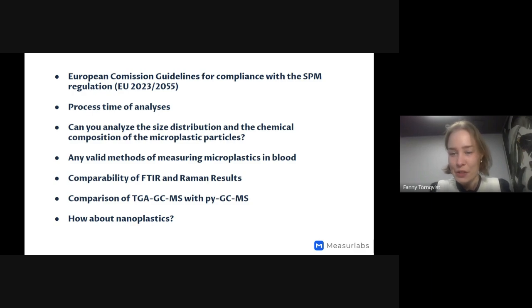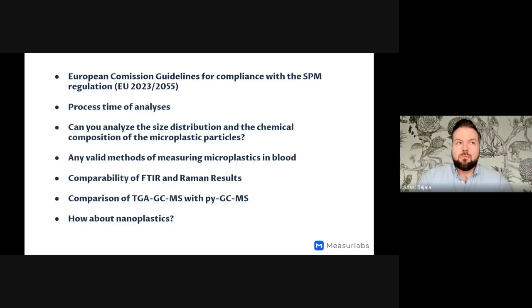Then there's a question, are these presented methods available regardless of how big the molecular weight of the polymers is? For example, microplastics with molecular weight 100,000 daltons? I don't really think that the molecular weight itself affects much. In this case, it's more the particle size that affects the results.